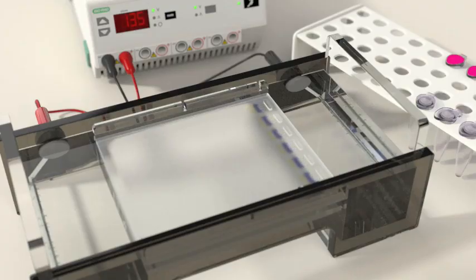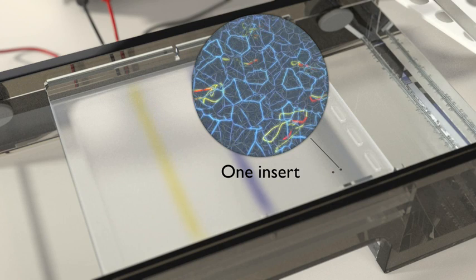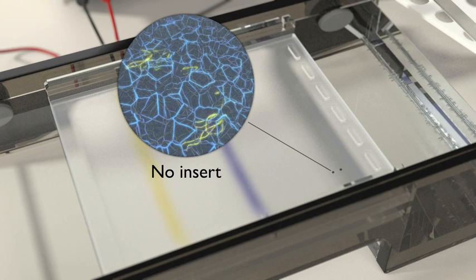Two principal factors affect how quickly a piece of DNA will migrate through agarose gel: its overall size and its shape. The larger the piece, the more slowly it will move. The more compact a fragment, the faster it will move.